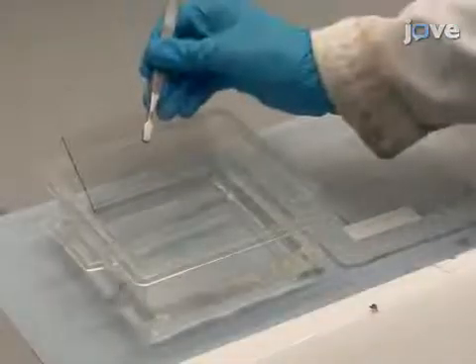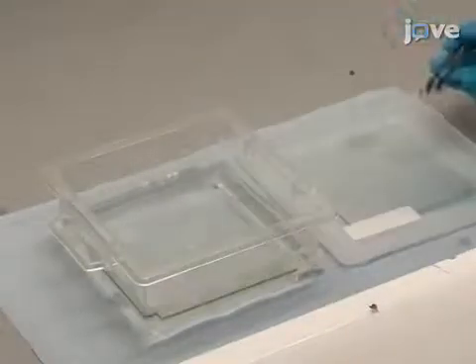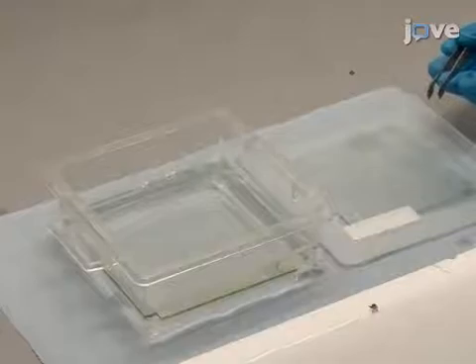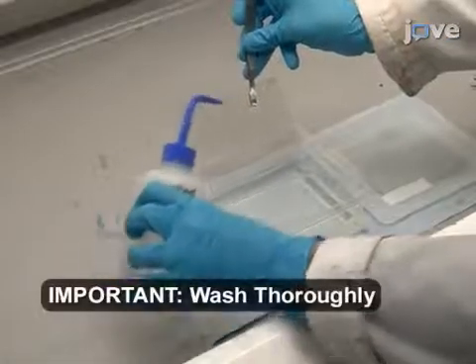Prior to initiating printing, soak the glass substrates in a 2 weight percent solution of cleaning detergent in deionized water for 24 hours. Remove the substrates and rinse thoroughly with deionized water before use.